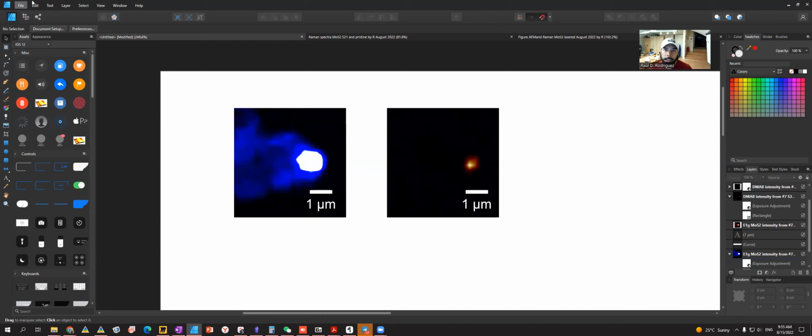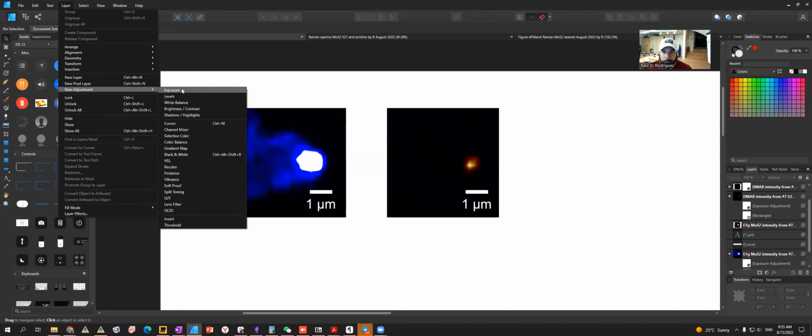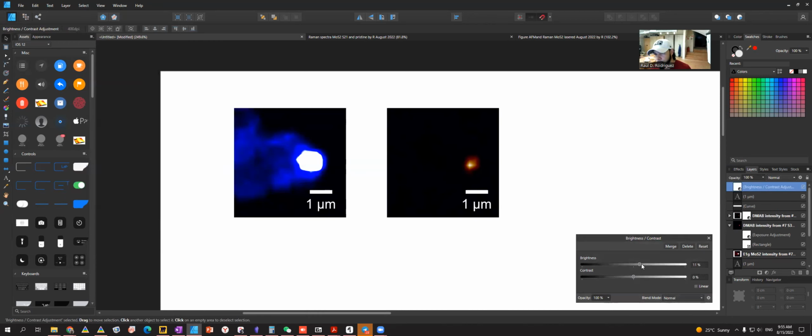I will leave it in normal, and then I will come here to the brightness and contrast. Increase a little bit, and you see that this is being applied to all of these. If I change this one, it's changing the other one, but that's not what I want. What I want is to apply changes only to this one. So you need to change the hierarchy of the changes you're making there and put it here. Now these changes will still, no, it's this brightness. So I need to change it, but I already have a brightness there.